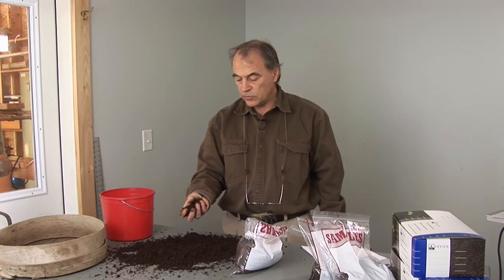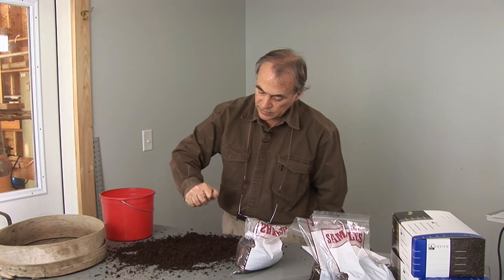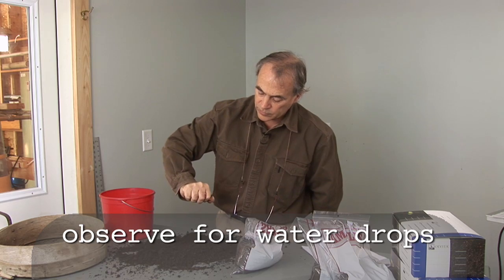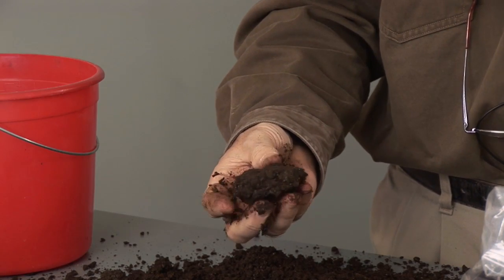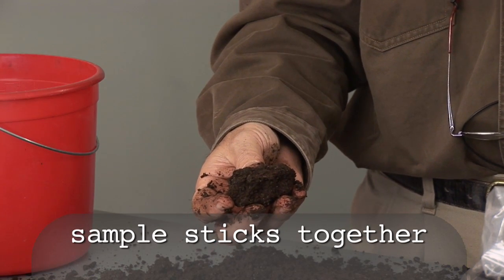Place the compost in your hand like this and squeeze it very, very hard, trying to observe if any moisture comes out between your fingers. It should not run out between your fingers when squeezing very hard, and it should be clumpy like this when you open your hand again. This is a perfect level of moisture for the compost test.